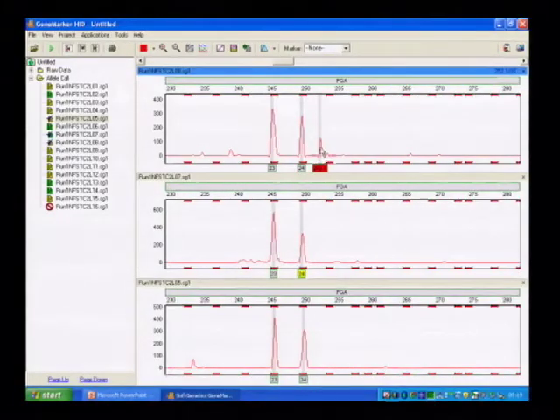And then red. And this is the 0.25. And you'll see for red, for this specific trace, there's an extra peak that's called. So this comes into question: is it really a peak, or is it some type of color correction issue? And for this particular peak, we can check.